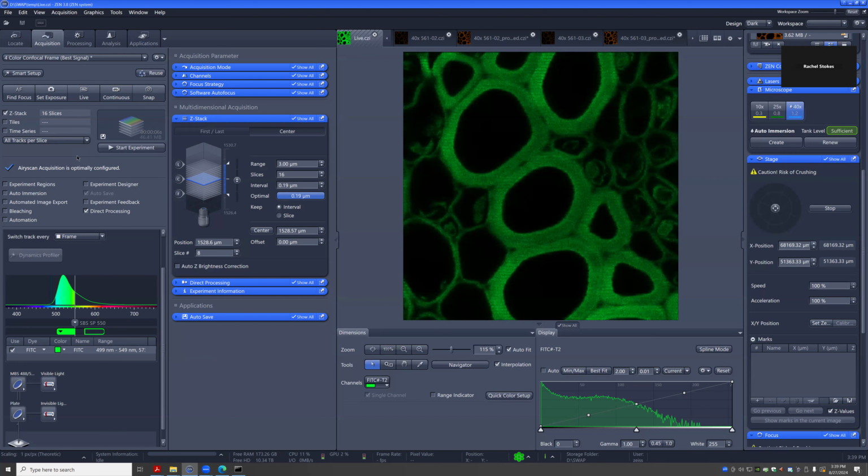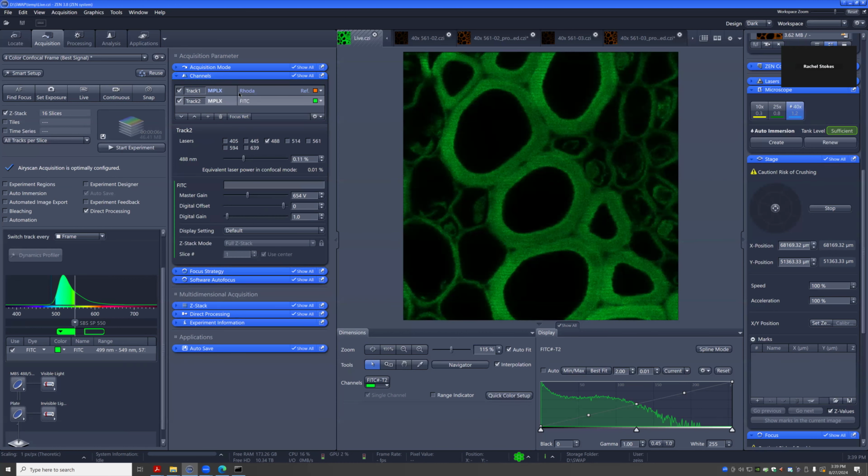Yeah. When you click that one, it changes to frame. When I did all tracks per slice, it switched to frame. You can do a line. So I guess it is on a, oh, I see. Yeah, it's because probably the filters that we put in. I wouldn't want to do line mode here anyways, because I would do it differently here.